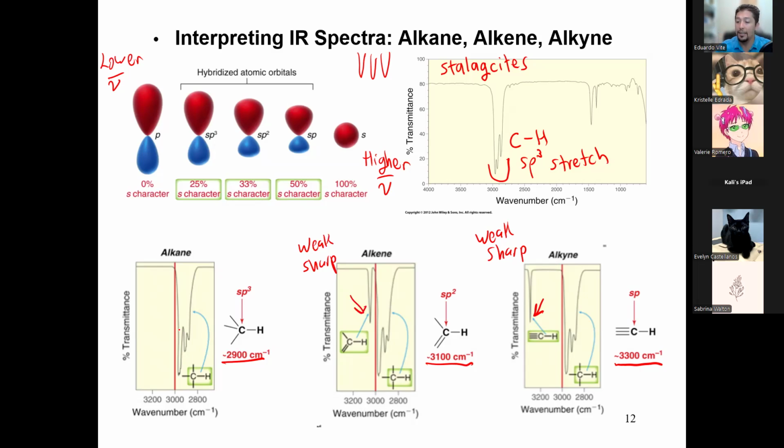So this is how you can tell if you have a double bond or a triple bond in your hydrocarbon chain. Does that make sense? You look at the characteristic peaks. You don't have to look at everything. And I think some of you might have a question, which might be something like, well, what are these over here? Well, they're at 1,500.